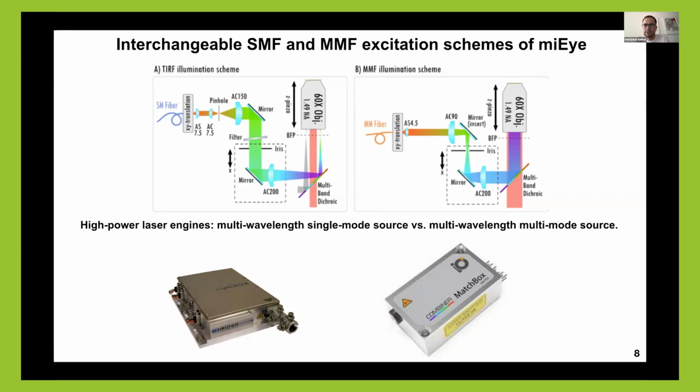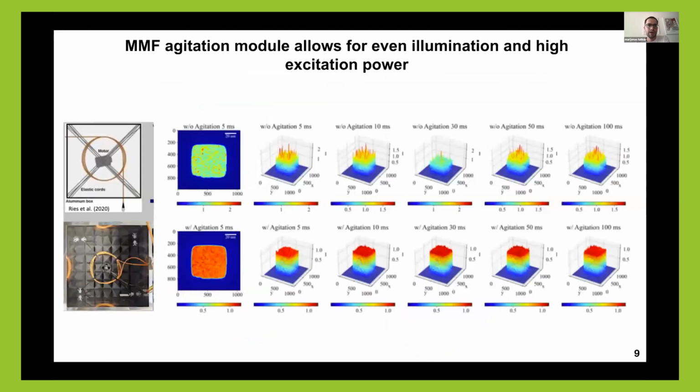We interchange between these two excitation modes just by using a mirror on a magnetic holder. So it's very easy to do that interchange even in a single experiment. Our laser is around 10,000 euros, and then the rest is just the fibers and coupling optics.